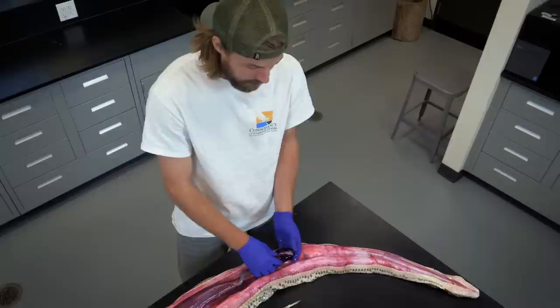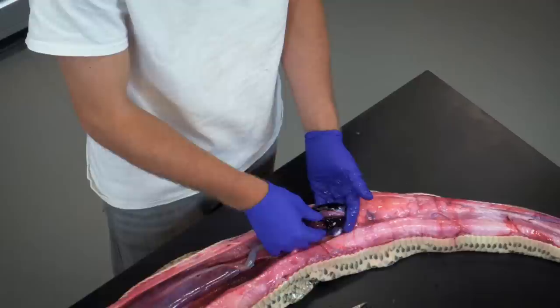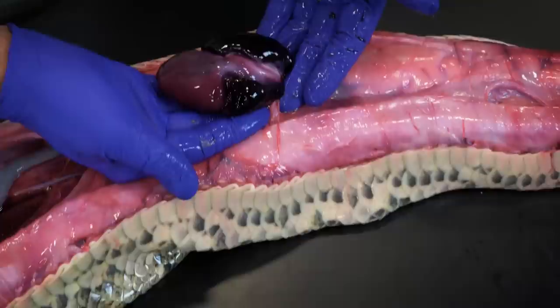Pythons, like most other reptiles, have a three-chambered heart — one, two, and three. The only reptiles that don't have three-chambered hearts are crocodilians, like alligators and American crocodiles.